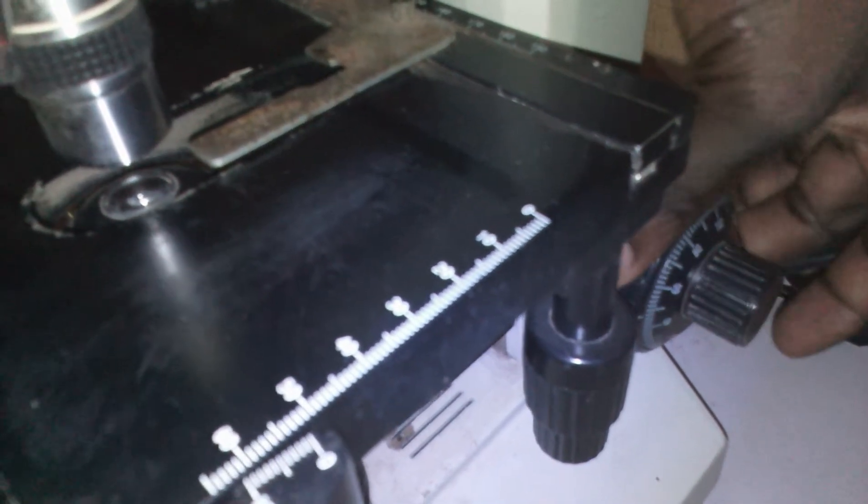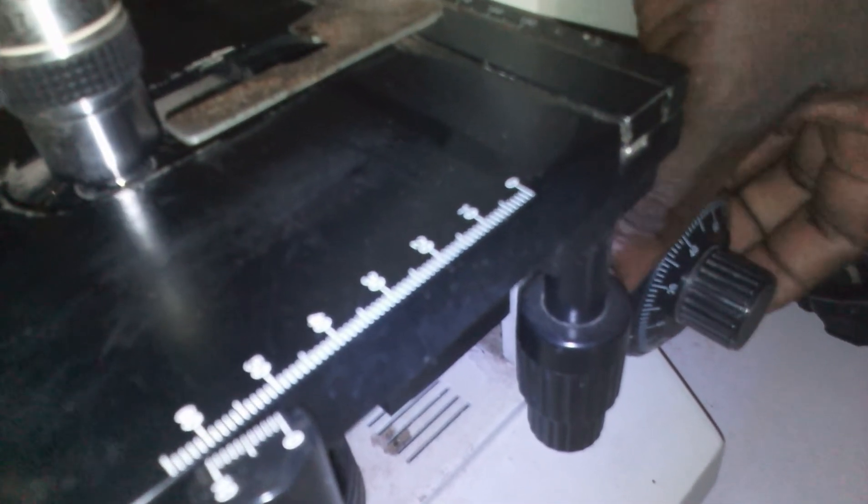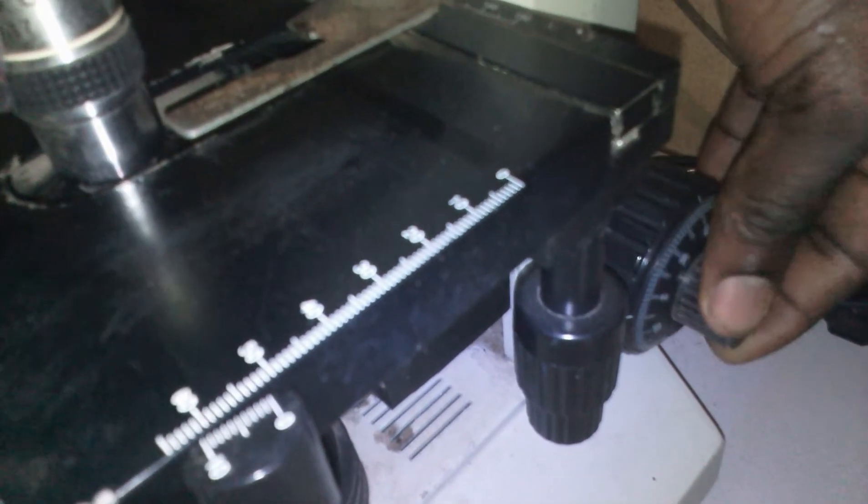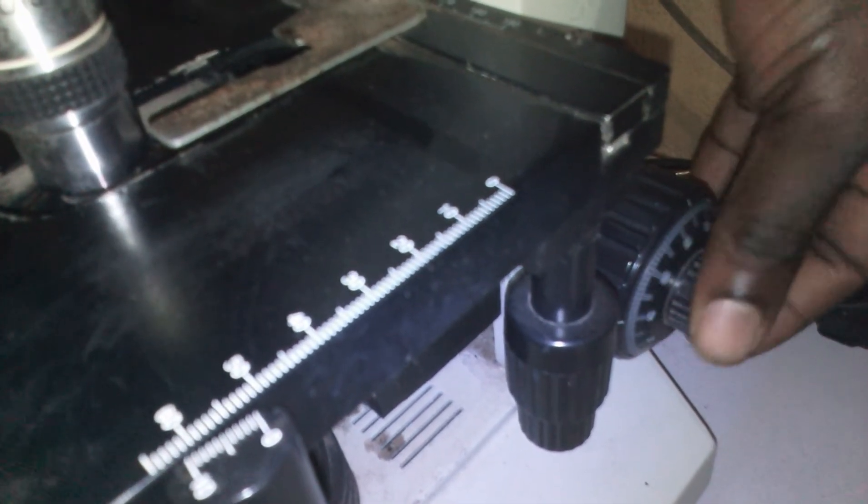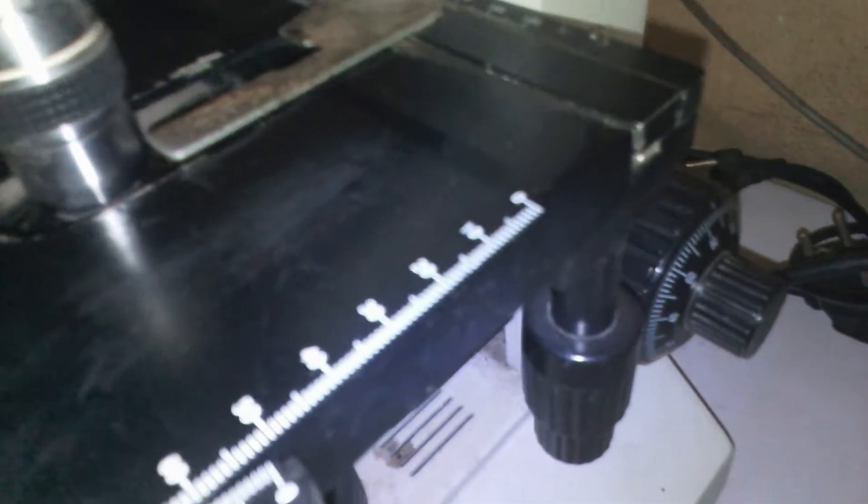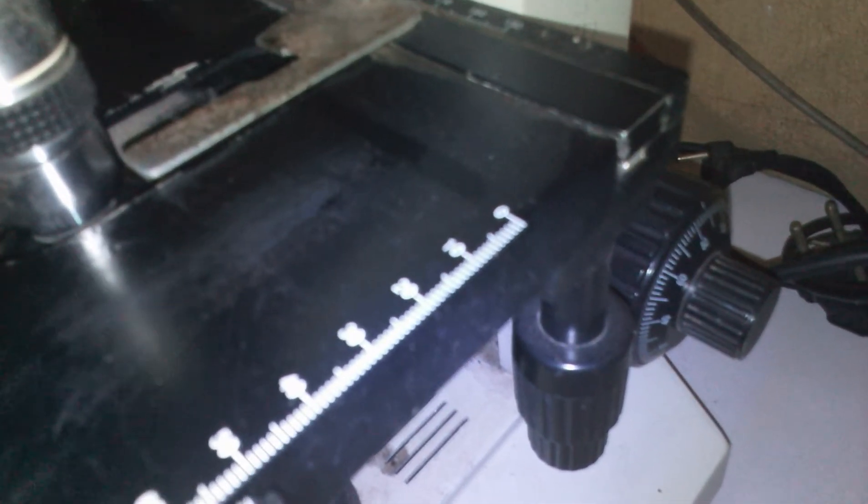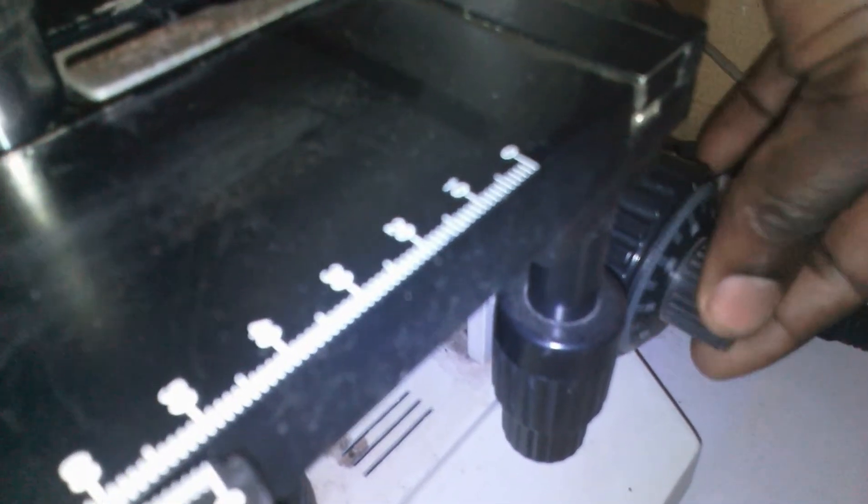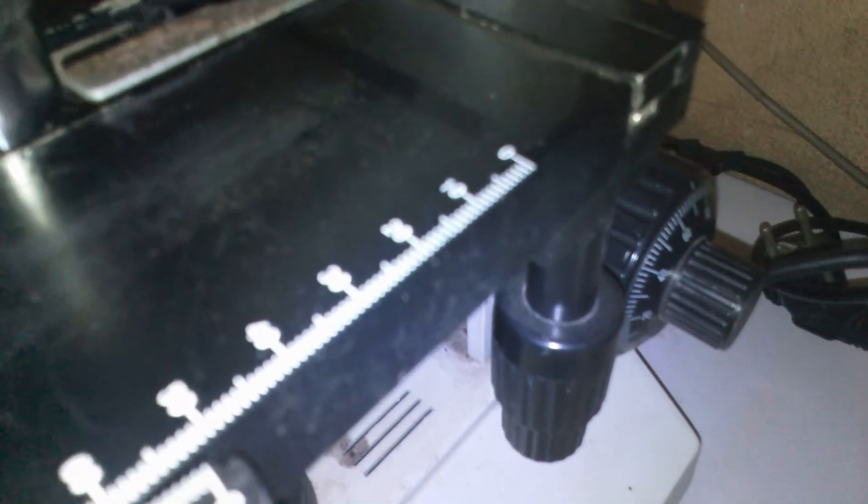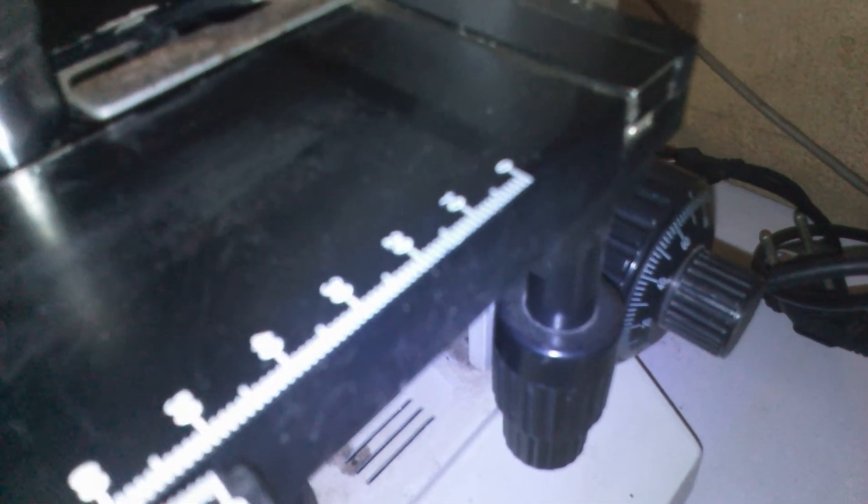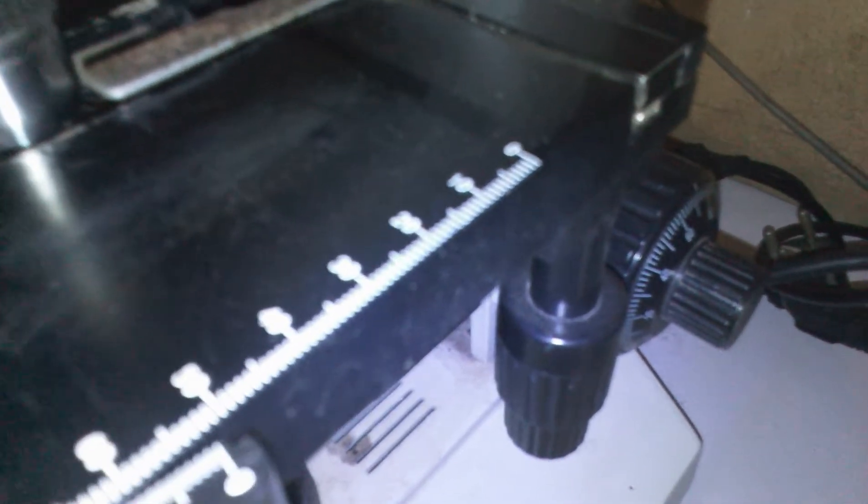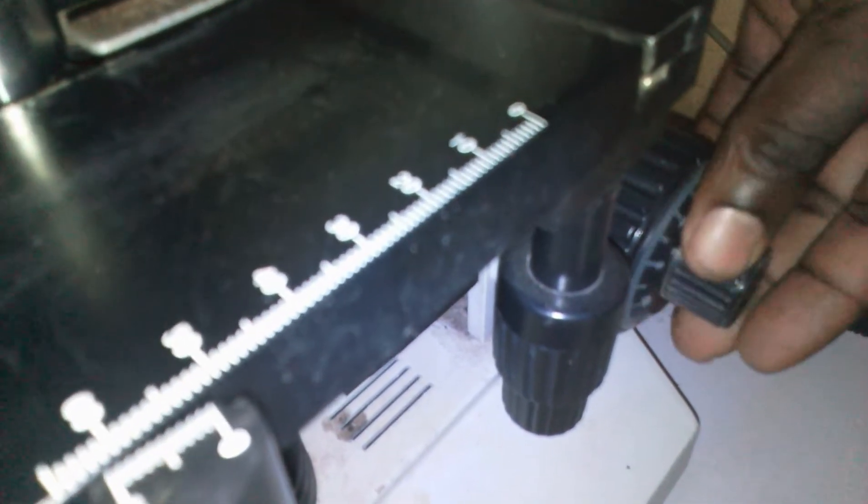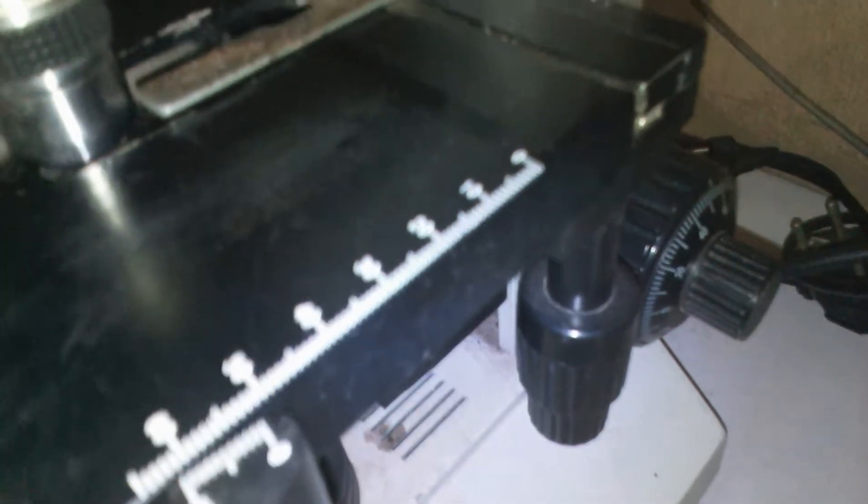This is your fine adjustment. When you've got close to the focus of your view and what you want to look for, then use this one to bring out the accurate image or picture of what you're looking for. This is called fine adjustment.